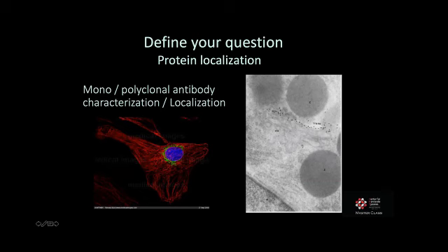If we take the same antibody and do EM with it, we can see that we've gained a lot more information: no, this is not a Golgi label. This protein is located just to the trans side of a Golgi stack. So that level of resolution is what you're going for when you're doing cryo-immuno-EM.